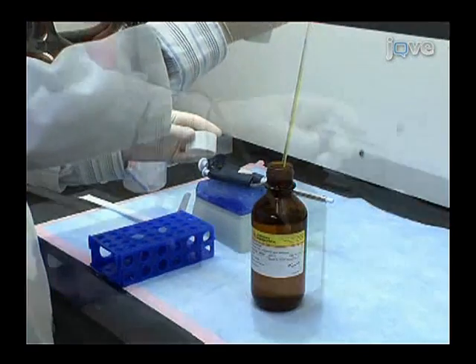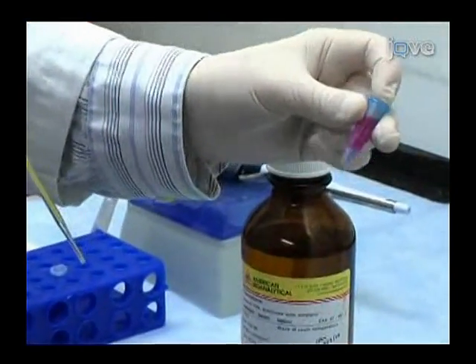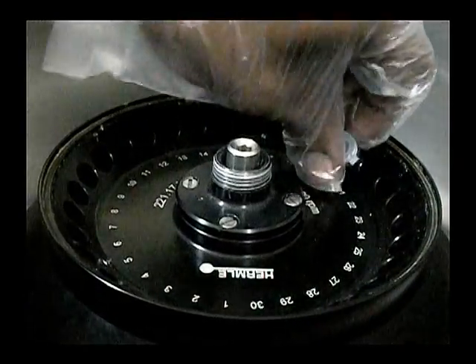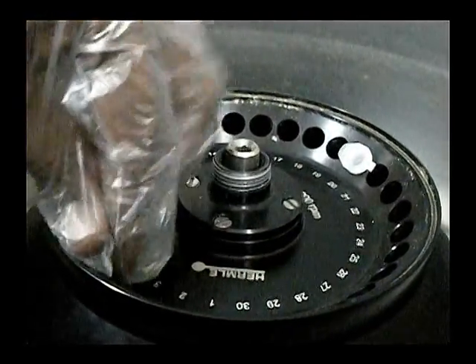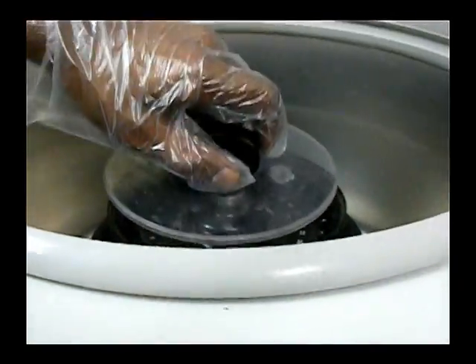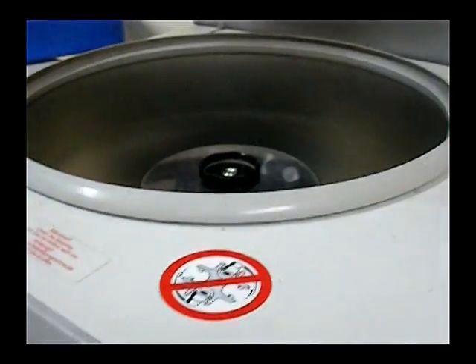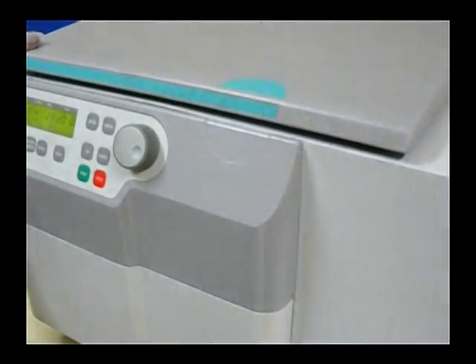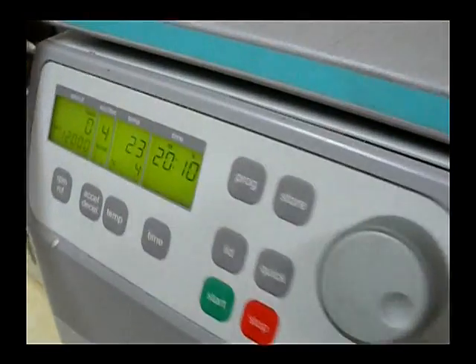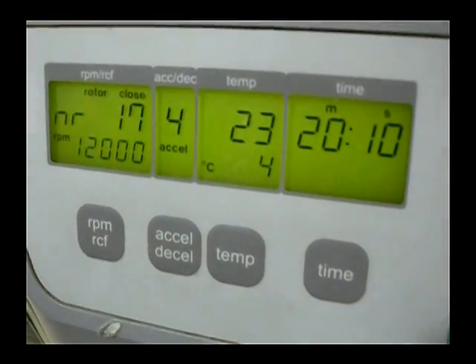Followed by 0.2 ml of phenol chloroform and incubation at room temperature for 2 minutes. Now the mixture is subjected to centrifugation at 12,000 RPM for 20 minutes in ice-cold conditions.